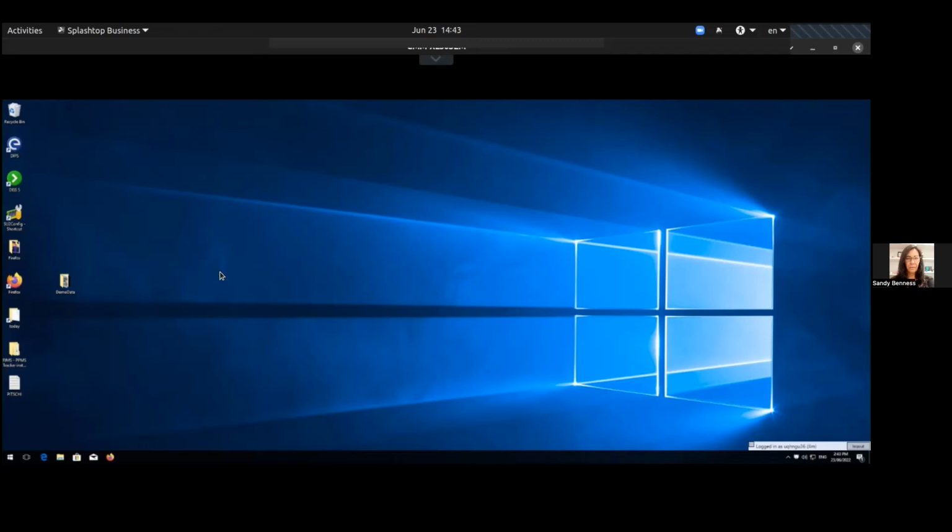I explain it a bit later in the talk, but we had to work with the instrument custodians and lab managers to have a checklist, which is present next to the instrument: what to do, and what happens if other users are waiting to use it.